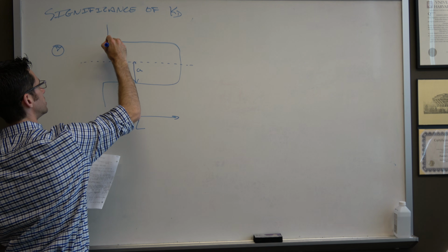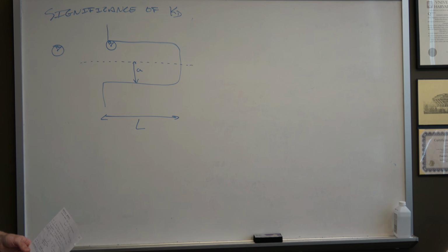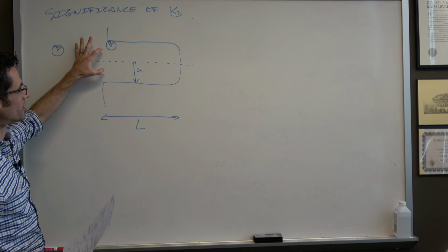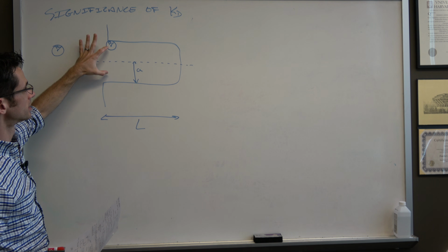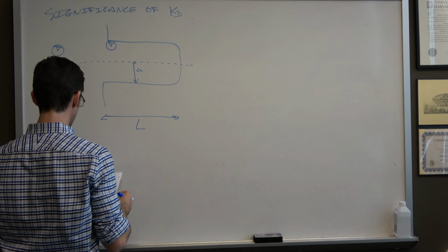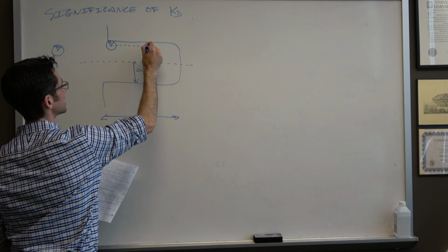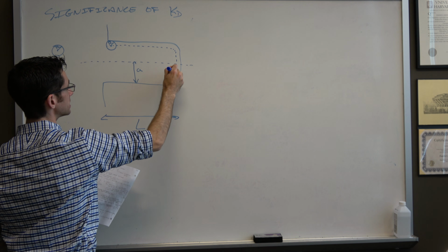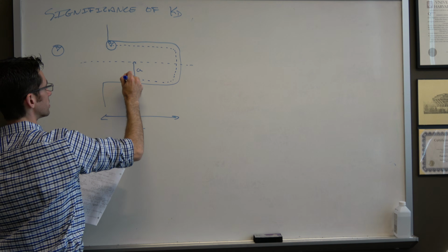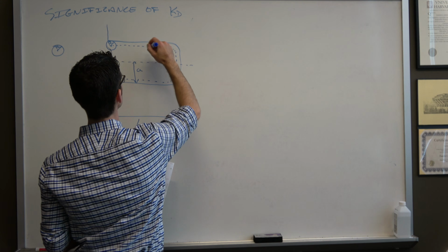Now, as the solute molecule goes into the pore, the center of the solute can actually enter a cylinder that's smaller than the actual cylinder because it has some finite radius. So really it's this cylinder that the center of the solute has access to.